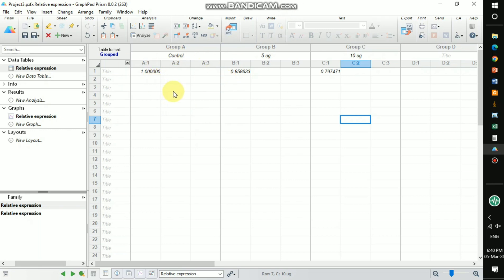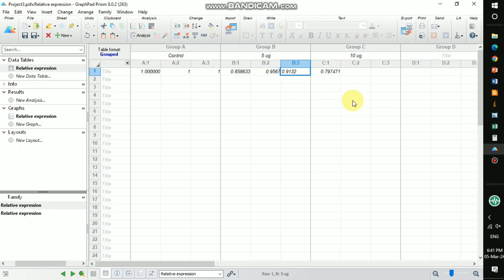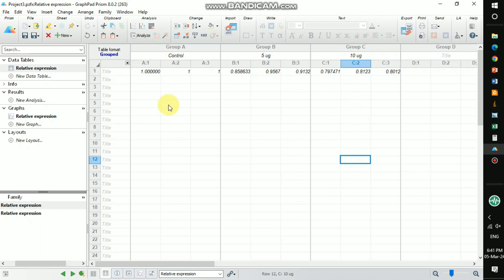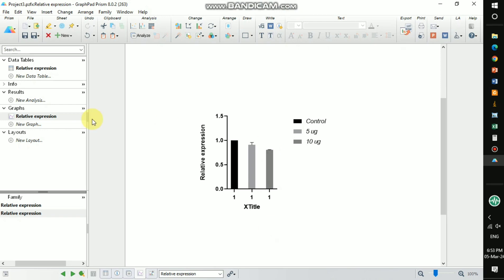For example, just to demonstrate the graph and statistical analysis, let's assume the control group values are 1, 0.9567, and 0.9012, and for the 10 microgram group: 0.8123, 0.80123. After entering those assumed values into Prism, we automatically get the graph. The control group should always be centered around 1.